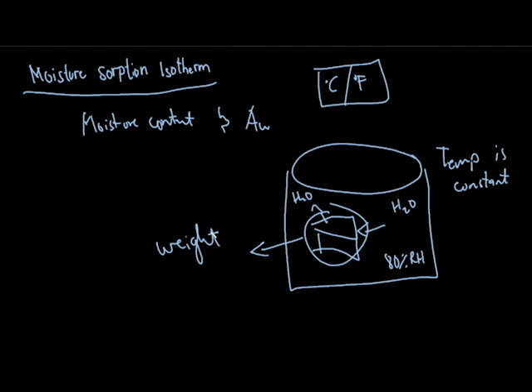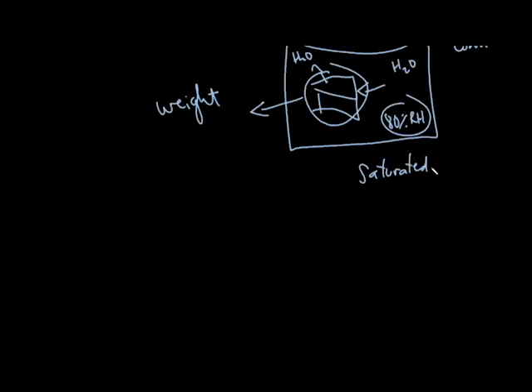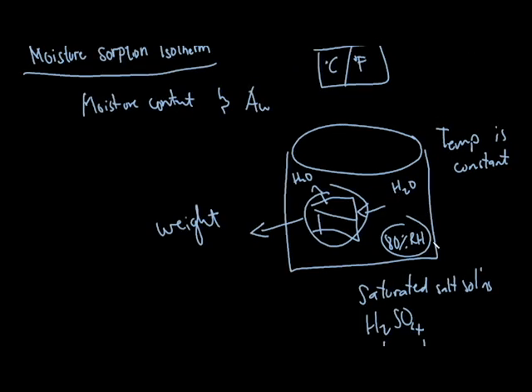To be able to create an environment with a constant relative humidity, saturated salt solutions, sulfuric acid, or glycerol can be used at certain ratios to maintain the target relative humidity. The principle behind it is that when a food product is exposed to a certain relative humidity, it will try to achieve equilibrium with its surroundings, either by adsorbing water or by losing some of its moisture to the environment.